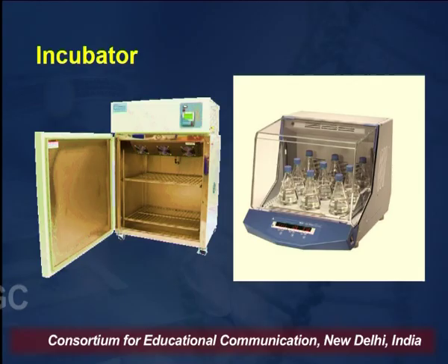And now we have the other instrument, which is called the incubator. Once everything is sterilized, you need to store it. So, you store it in an instrument called an incubator. The incubator provides the space for the microorganism to grow. Once you culture your microorganism either in solid media or in liquid media, you put them in the incubator, because the incubator will provide a steady temperature and agitation.